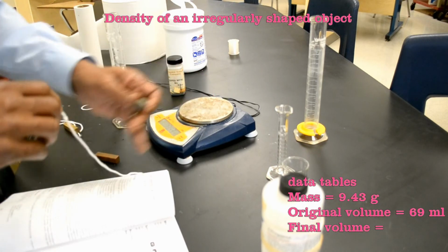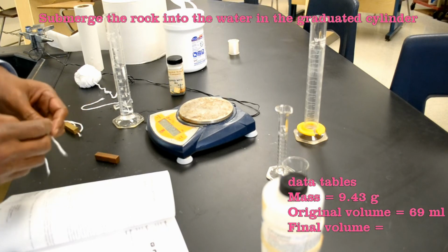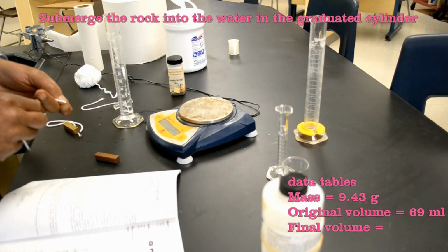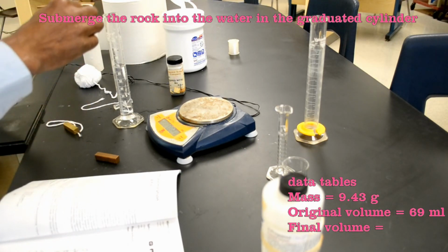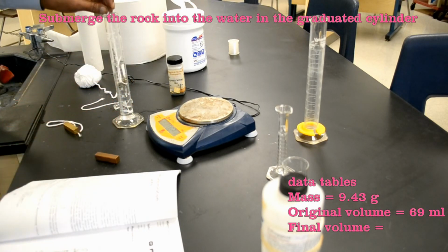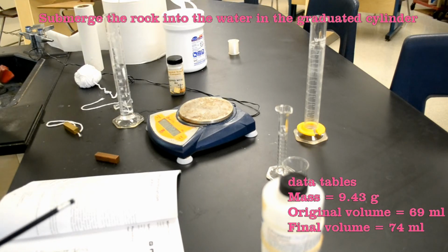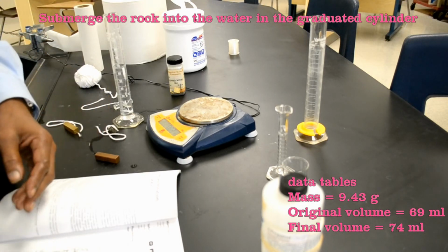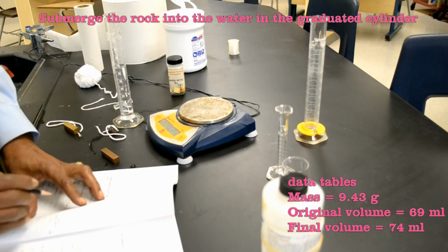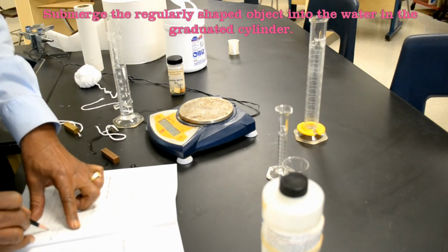Now I have to tie my rock onto the string and submerge it into the graduated cylinder. The volume goes up to around 74. So the volume goes from 69 to 74.